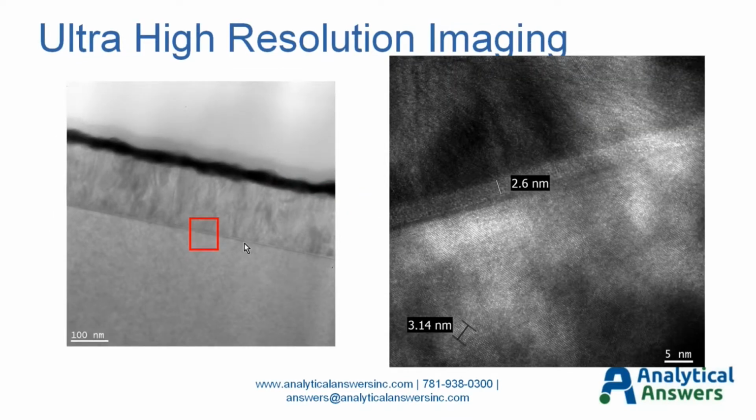And we can look at that in even higher detail. This now is a high mag image, ultra high magnification, to look at the gate oxide and check its dimension. Once again, we see lattice structure within the single crystal silicon substrate, and also in areas of the polycrystalline silicon above it.